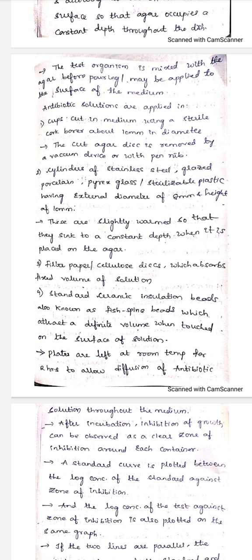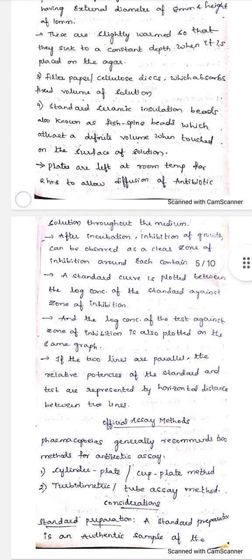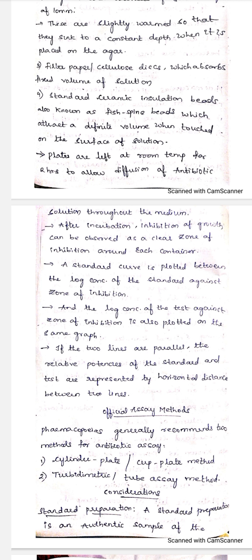Cylinders of stainless steel, glazed porcelain, Pyrex glass or sterilizable plastic, having an external diameter of 8 mm and a height of 10 mm, can be used. These are slightly warmed so that they sink to a constant depth when placed on the agar. With these you can make holes in the middle of the petri plate and remove the agar. Next, filter paper or cellulose discs absorb a fixed volume of solution, and standard ceramic insulation beads, also known as fish spine beads, attract a definite volume when touched to the surface of the solution. You can use any of these as a disc in the center of your petri plate.